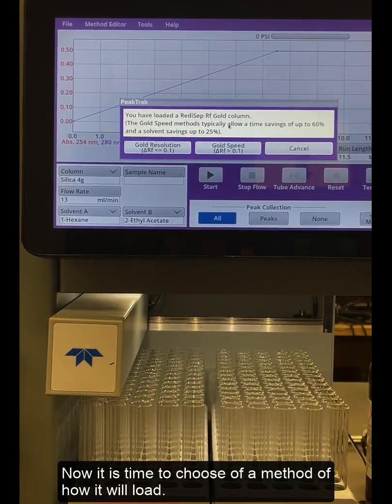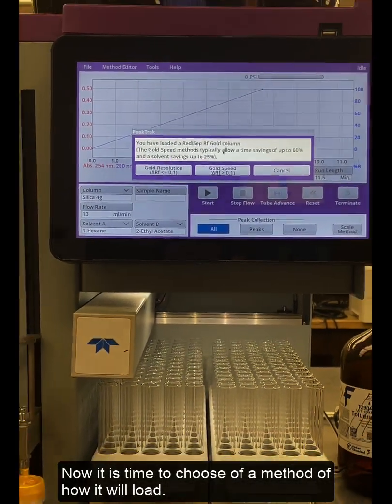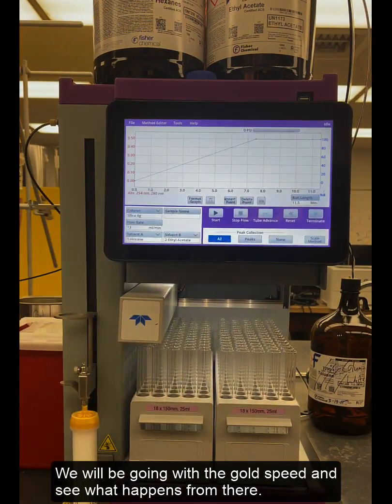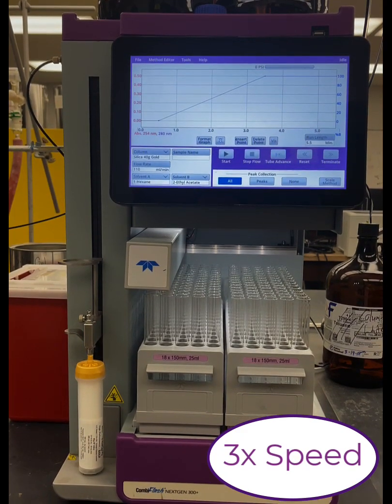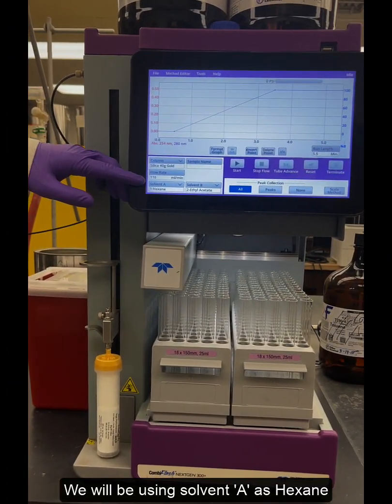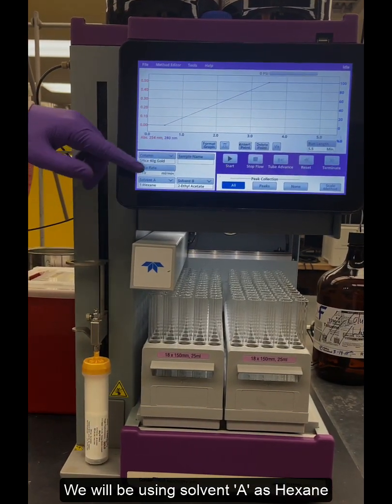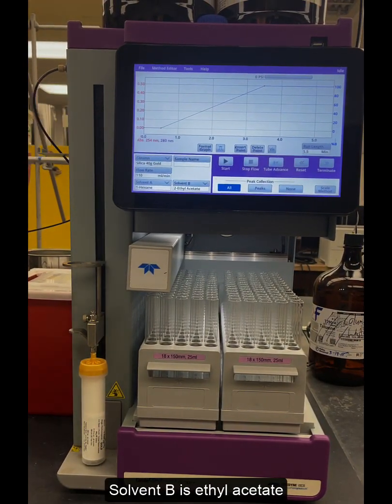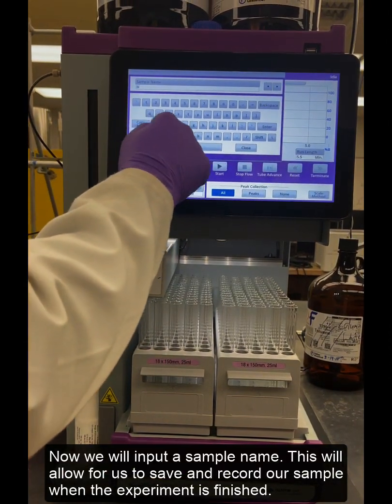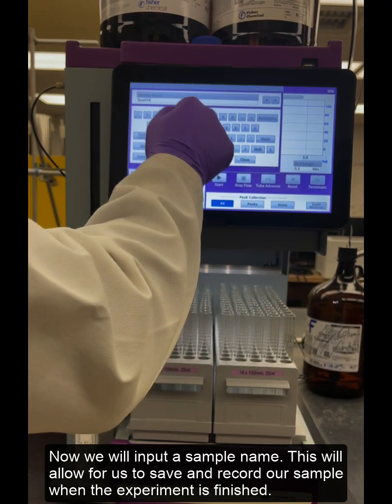Now it is time to choose a method of which how it would load. We will be going with the gold speed and see what happens from there. We will be using solvent A as hexane and right next to it solvent B is ethyl acetate. We'll be able to type in a name as a sample name which would allow us to save and record the sample when the experiment is finished.